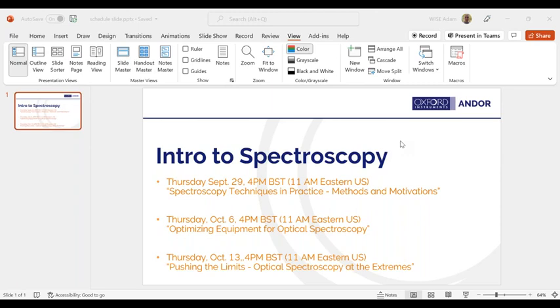So this is a question from the web saying, you showed the sun as an example. Well, the sun is obviously a very bright light source, and it's very broadband, so historically it's been very useful. Also, the light coming from it is pretty collimated, which makes it easy to focus if you want to burn something or focus into a fiber. So this person's asking, what if you had a tunable narrowband laser and you only used certain wavelengths? Well, that would be much better, because you'd have a lot more control over what wavelengths are going in.